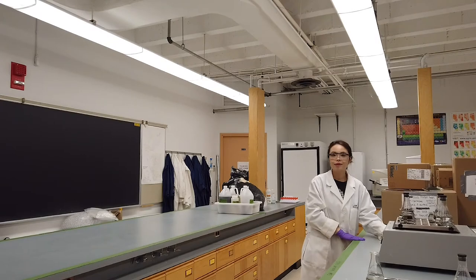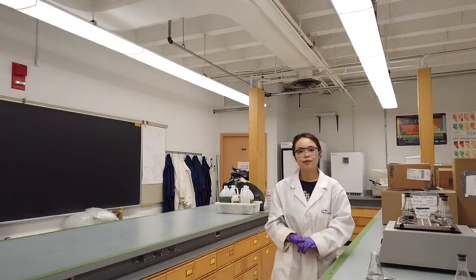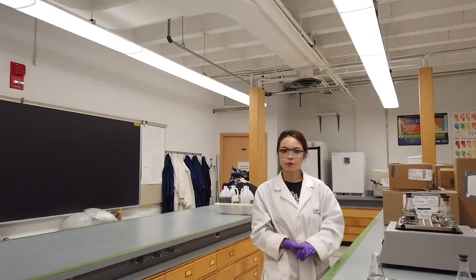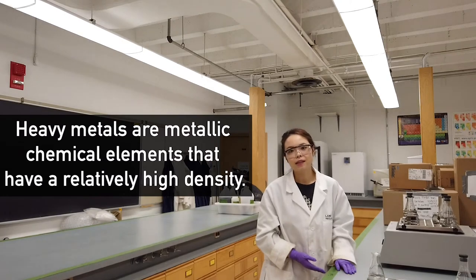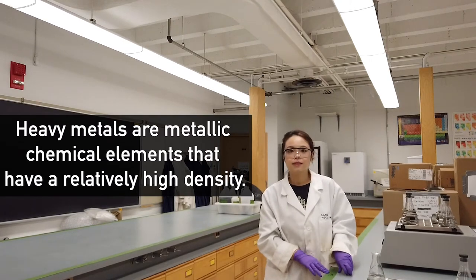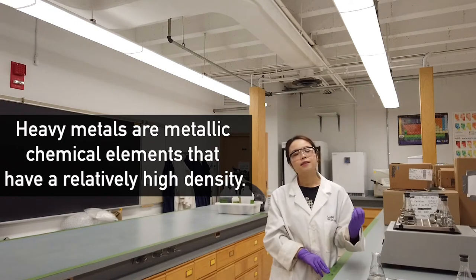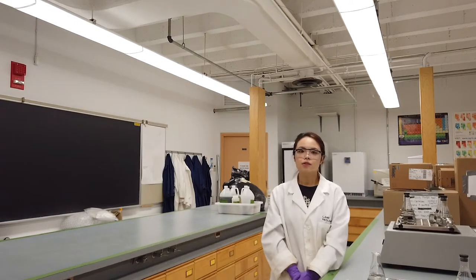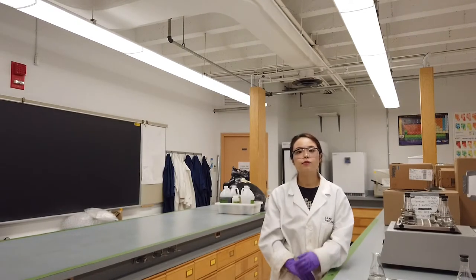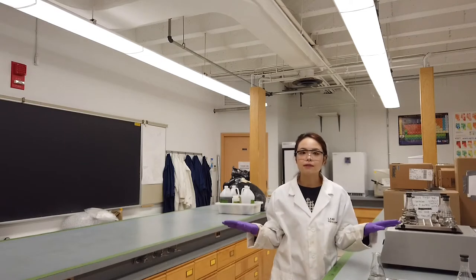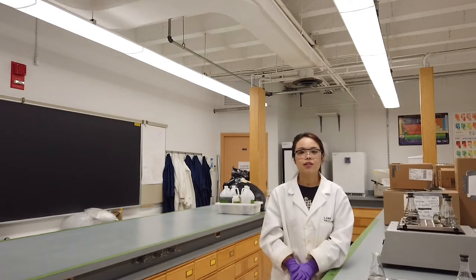I work here in the lab. For my work, I'm looking at removing contaminants called heavy metals. Heavy metals are metallic chemical elements that have a relatively high density, such as cadmium and lead. Soil and water can be contaminated with heavy metal from many industrial activities, such as mining.